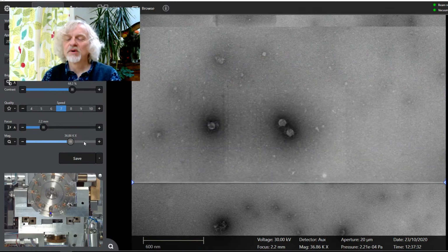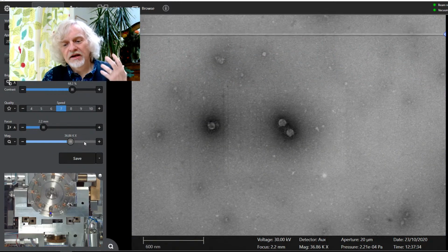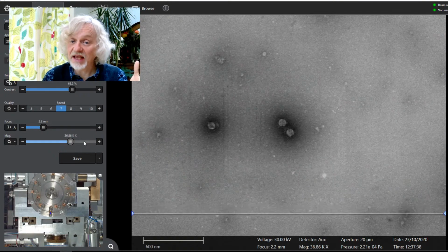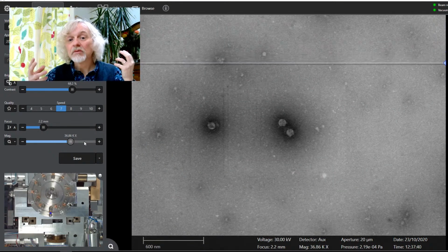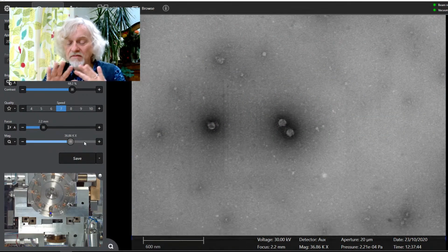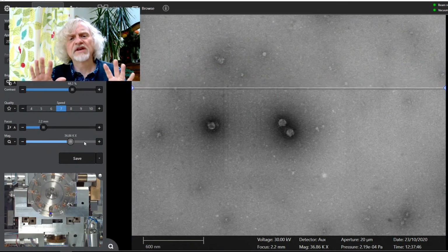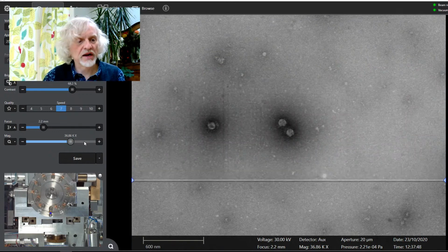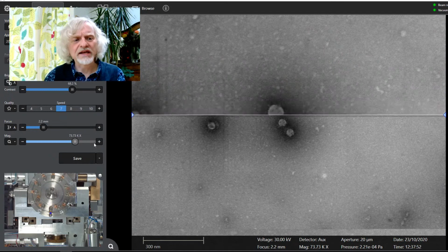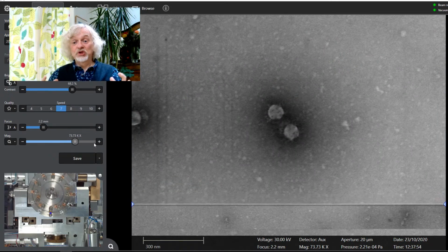And these are virus particles. These are COVID-19 causing virus particles. These virus particles, these particular ones, are fixed, which means they are inert. They are not going to cause a virus or COVID-19 in anybody. They are not going to be able to do anything. They're essentially dead, except, well, you get into the whole is a virus alive question. So we're zooming in a bit more.